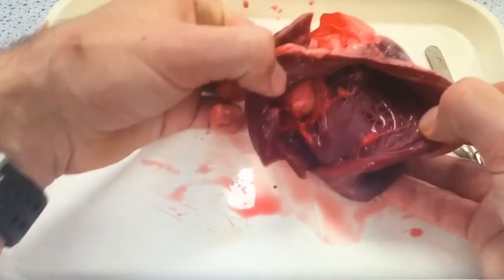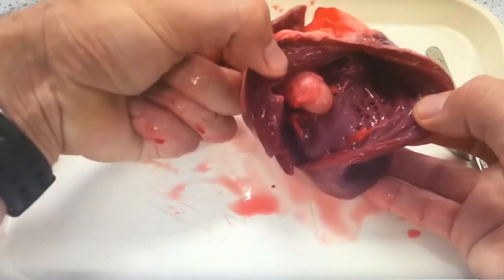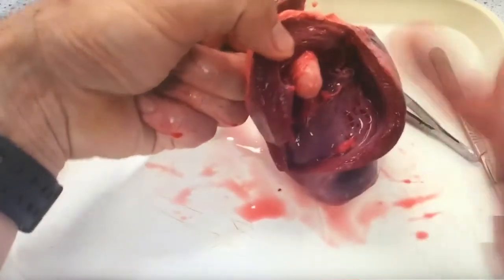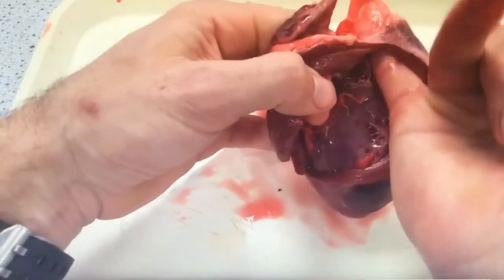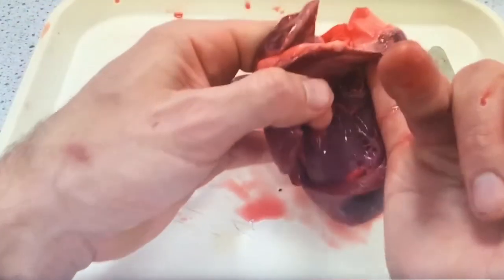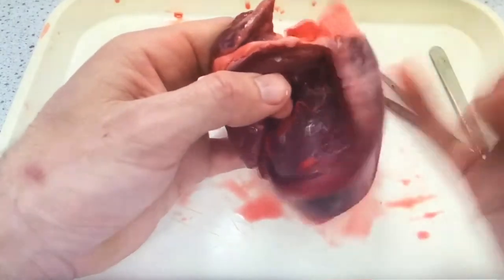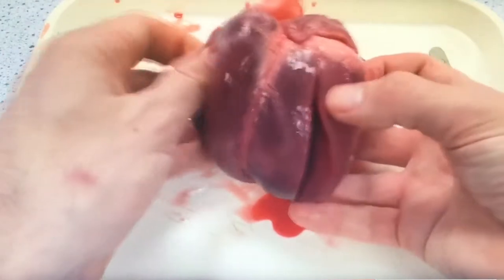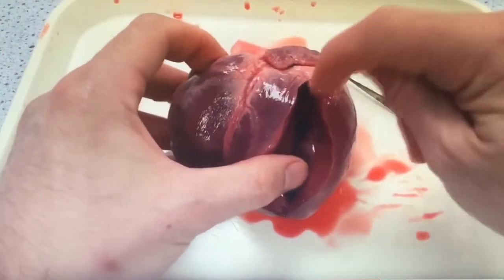Opening up the right side of the heart, which has already been cut by the butcher, we can see straight away the difference in the thickness of the muscle wall. Here we can see Sven sticking his finger down through the vena cava into the atria, which would then lead into the ventricles, and then putting his small finger up through the pulmonary artery, which would be on its way to the lungs.